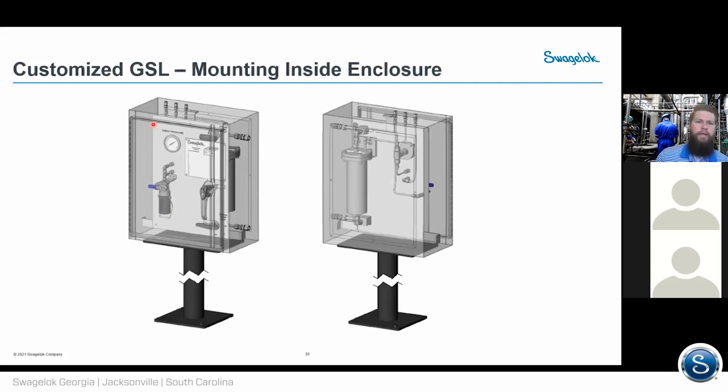If we had our typical installation, we would have the panel with things mounted on the back, and you wouldn't be able to access the back of the panel to work on any of the components without pulling the entire system out.